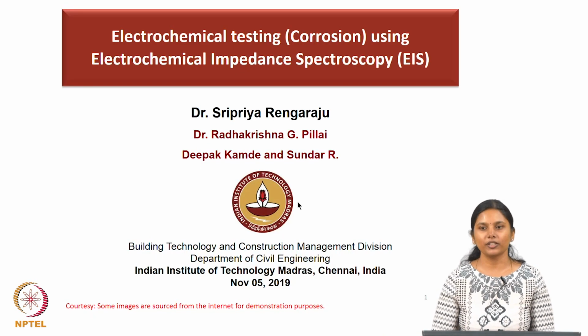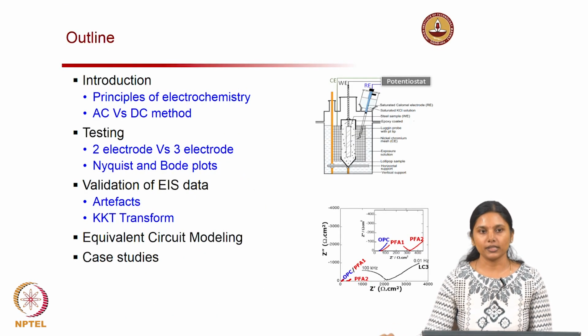I have recently finished my PhD in the area of corrosion. Today I will be handling the class with electrochemical testing using EIS. This is the brief outline of my presentation.